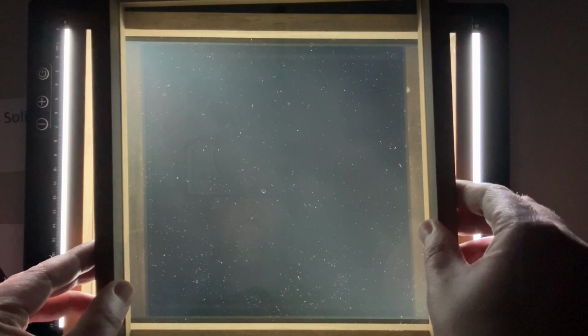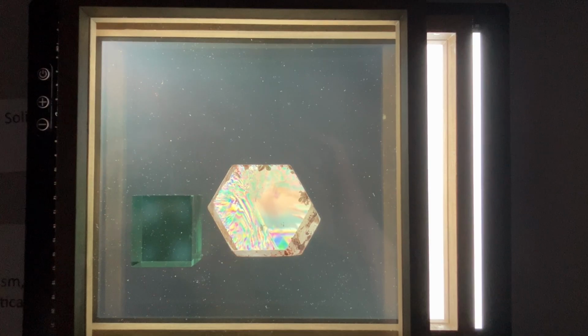We then brought in our second linear polarizer, oriented so that the vibrational direction it allowed light to pass is perpendicular to our first. By setting up our polariscope in this manner, we are at crossed polarizers, and this effectively blocks out the light coming towards us. However, if we add a mineral sample in between our two crossed polarizers, the crystalline structure of our mineral can reorient the light traveling through our crystal and allow it to pass through our upper polarizer.